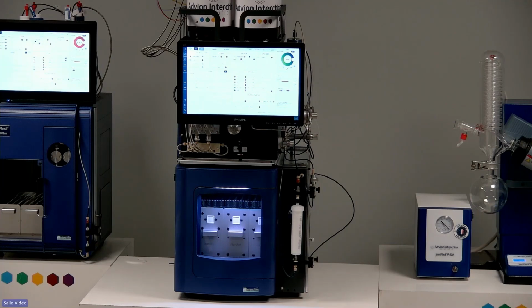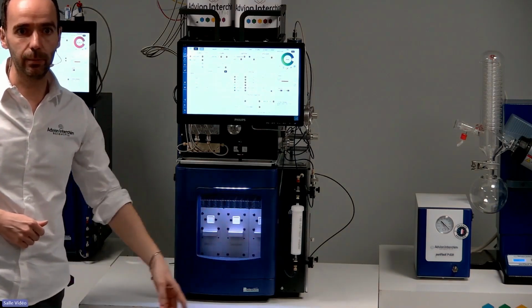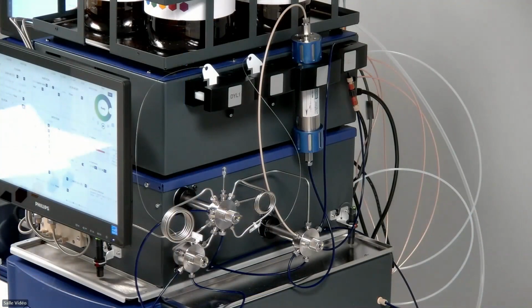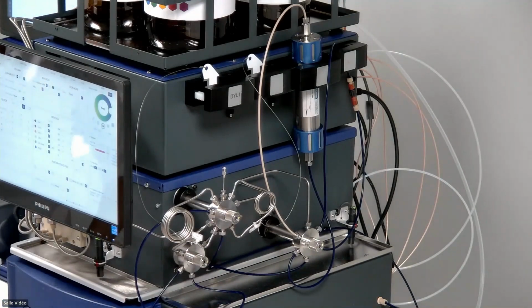On this system, you can have up to 3 column holders. One just there on the front of the system, and 2 others on the side. Column 2 and column 3. There is no dedicated column holder for Flash or Prep column. You can mix the column on the system up to you.